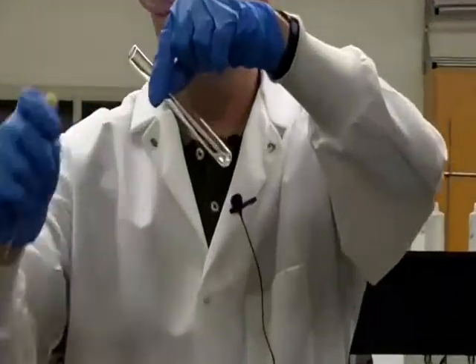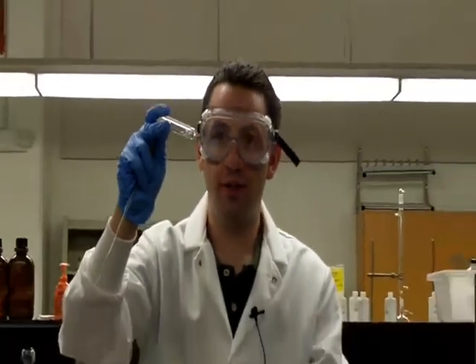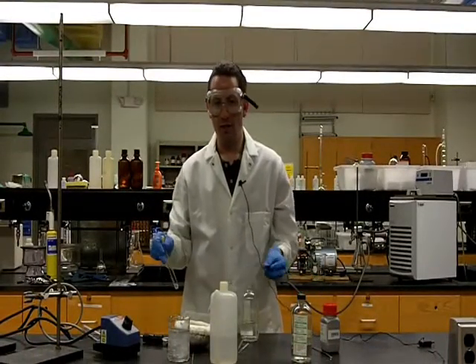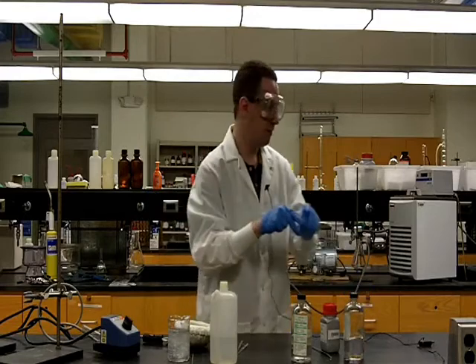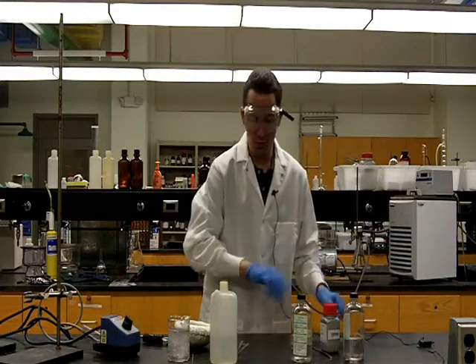So we now add a small amount of toluene to our test tube, and as we can see, it's already starting to dissolve the fluorene. And as I shake the test tube a little bit, we can now see that the solute has completely dissolved in the toluene. Since the fluorene has completely dissolved in the toluene at room temperature, that means the fluorene is too soluble in toluene, and we've now chosen a solvent that would be a poor choice for recrystallization, because we will not be able to get the fluorene to crystallize back out of solution.